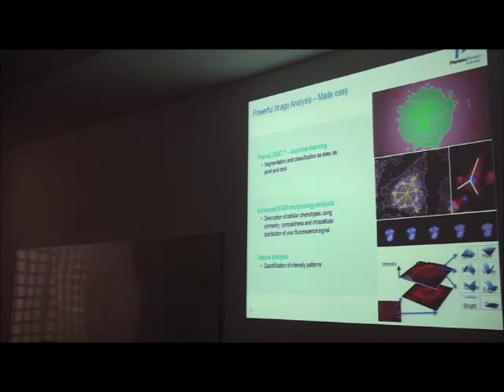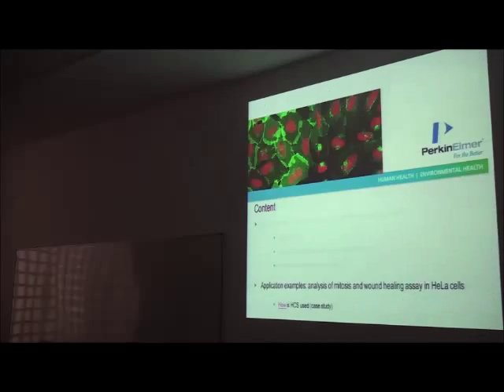More and more we see analysis based on advanced features like texture or STAR morphology. That's what we typically do here. Texture really helps moving beyond the morphology and intensity parameters that we know. STAR is another feature, and PhenoLOGIC is the machine learning, teaching the software to recognize the phenotype of interest and then doing it.